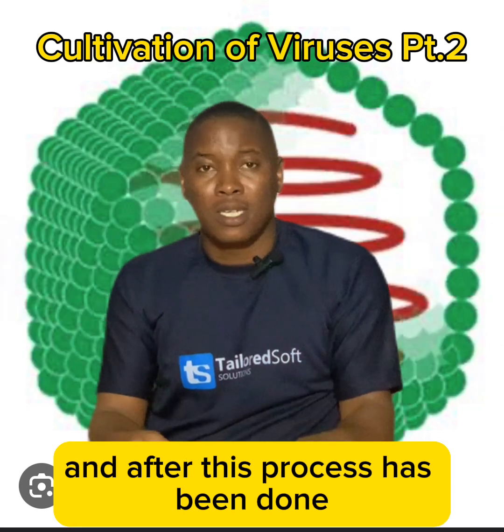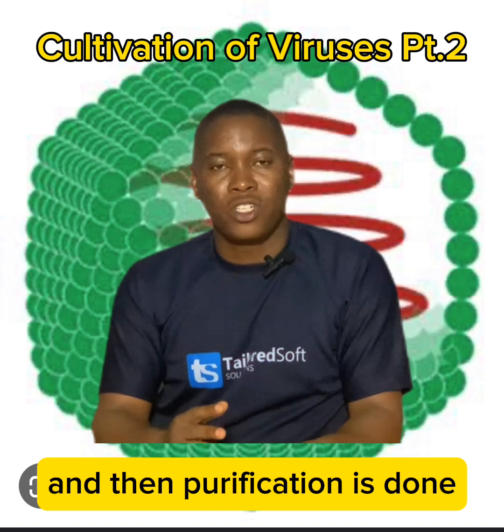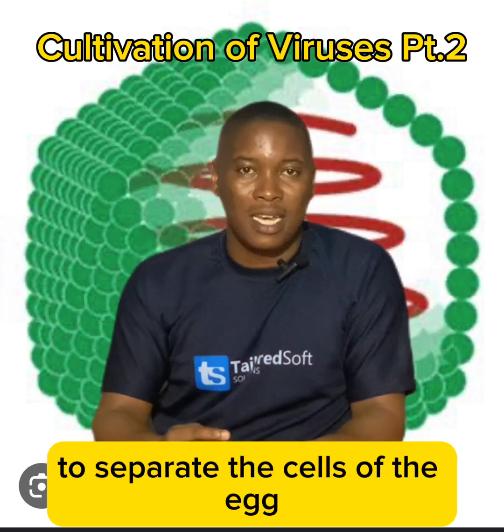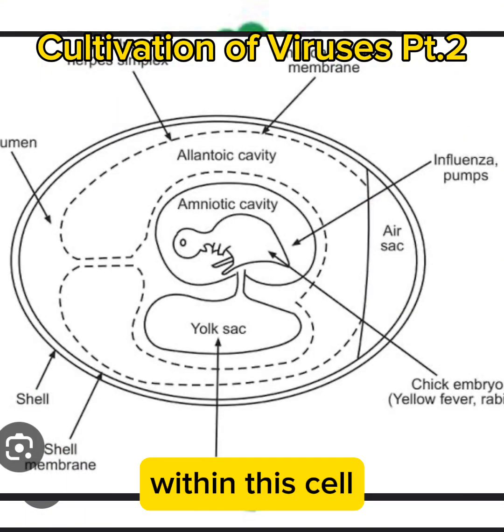And after this process has been done, the chick egg is broken and then purification is done to separate the cells of the egg from the viruses which have replicated within these cells. And this is quite important to know.